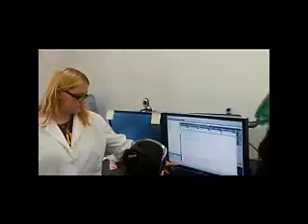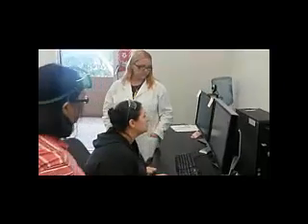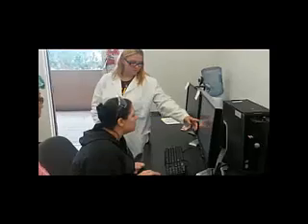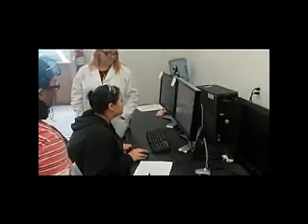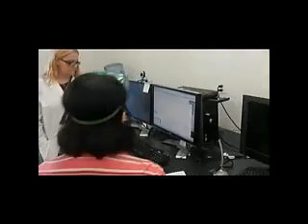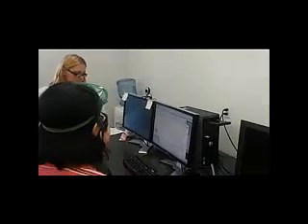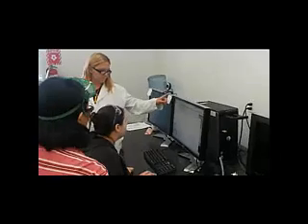Now the Mountain Dew was fairly good. The best thing also is we're not in that room, so it was all done kind of cyber, a little bit. At least we're not in the same room, in a small little room. We're just running it from here for right now, and you guys are getting the same experience as if you were actually in that room in front of the machine, but there's no need for that.